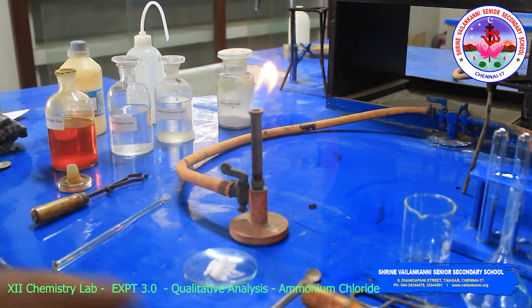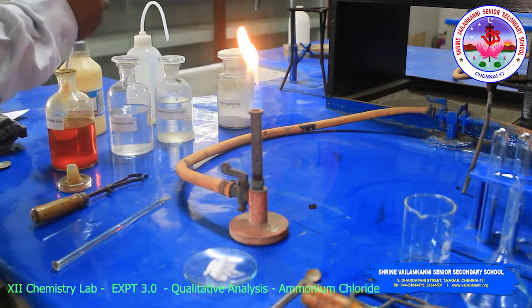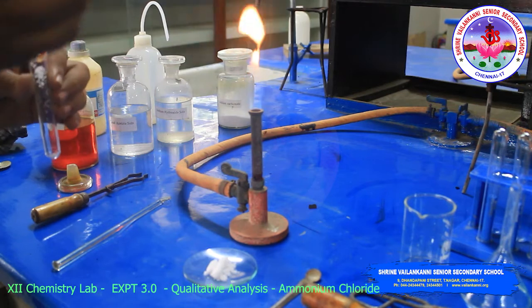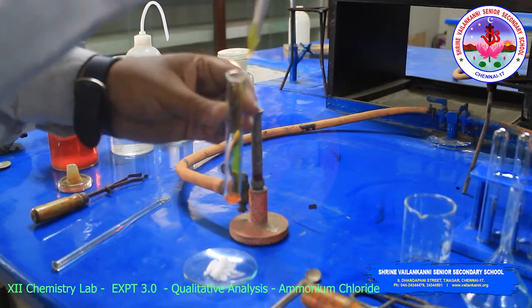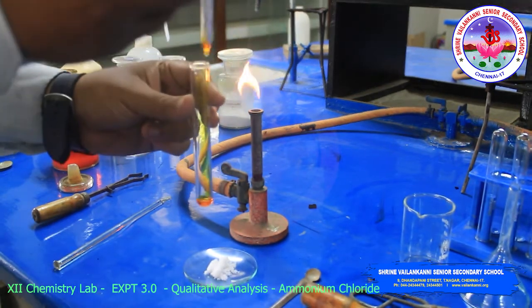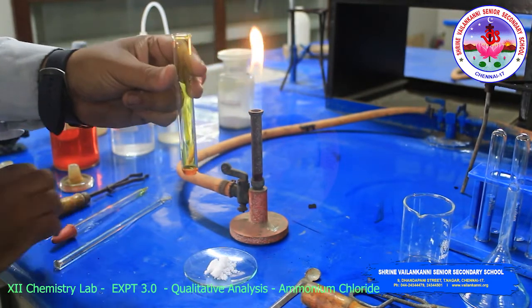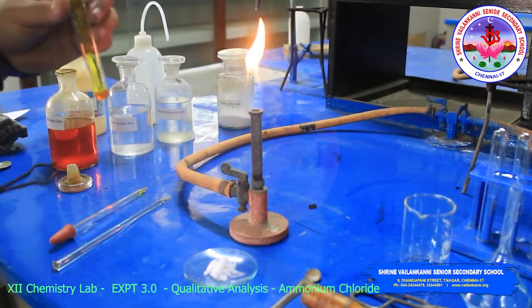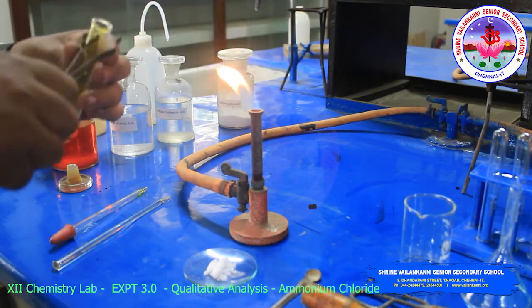I have solution. So potassium dichromate is added, then heat the potassium dichromate and the salt mixture.